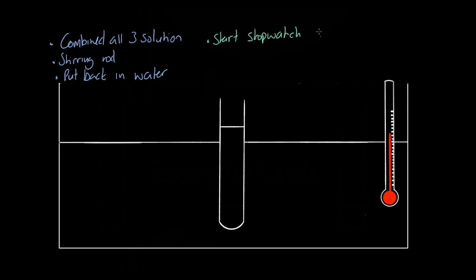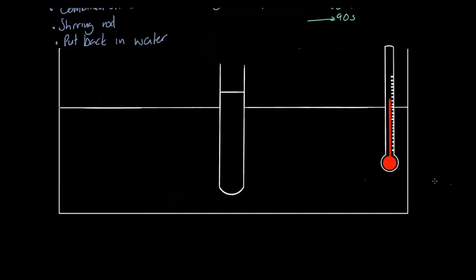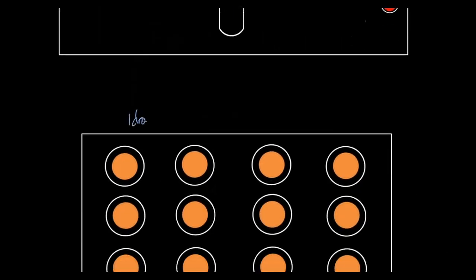We're now interested in taking an action at 30 seconds, at 60 seconds, at 90 seconds, and so on. What are we actually going to do? Well, at 30 seconds, we're going to take our stirring rod, dip it into our solution, take that stirring rod out, and we are going to place one drop of our new solution. We're going to take one drop and place it here in well number one, which is going to be representative of 30 seconds, because we're going to do this after 30 seconds.